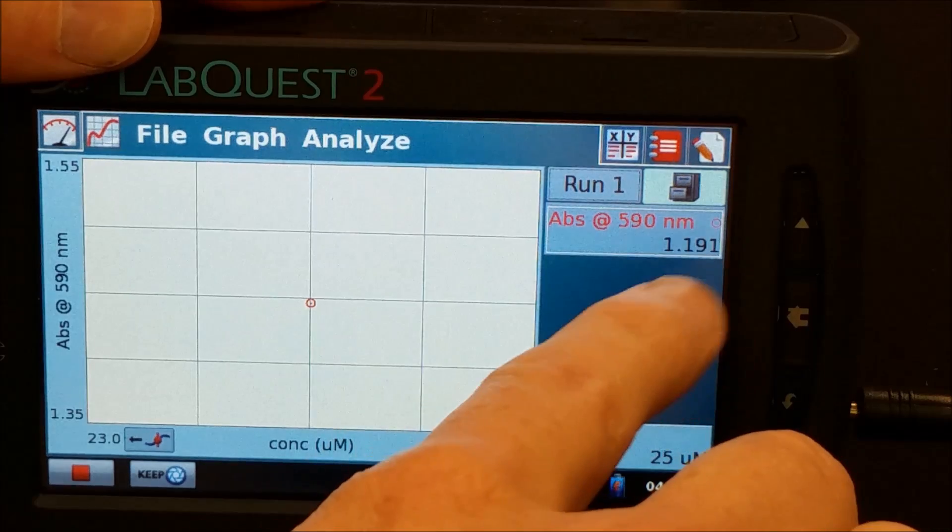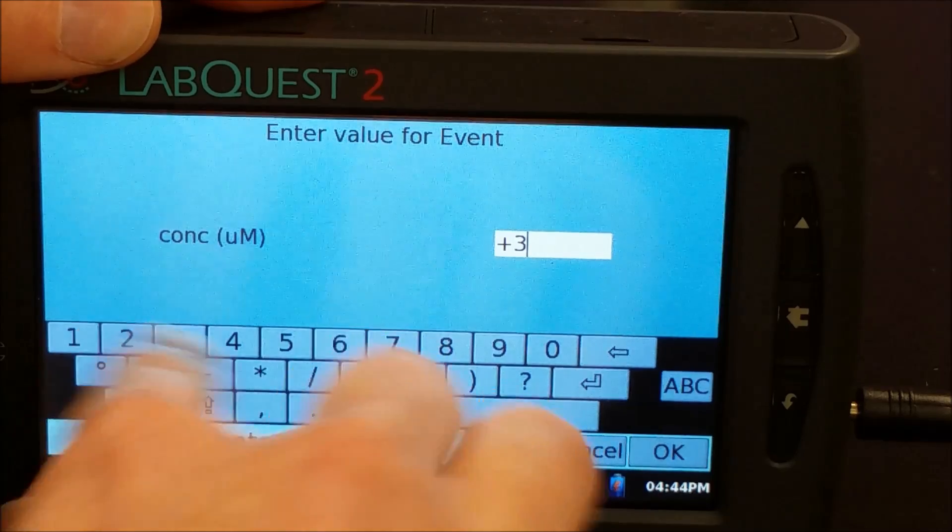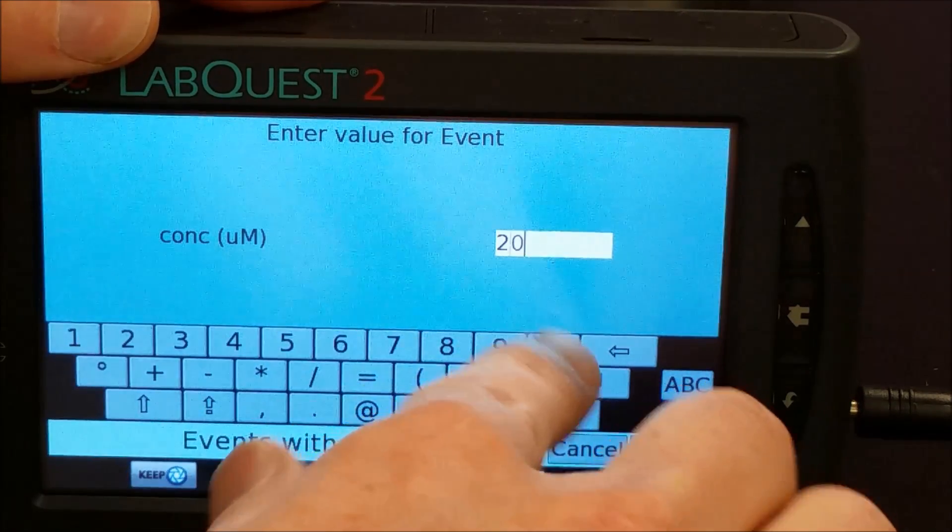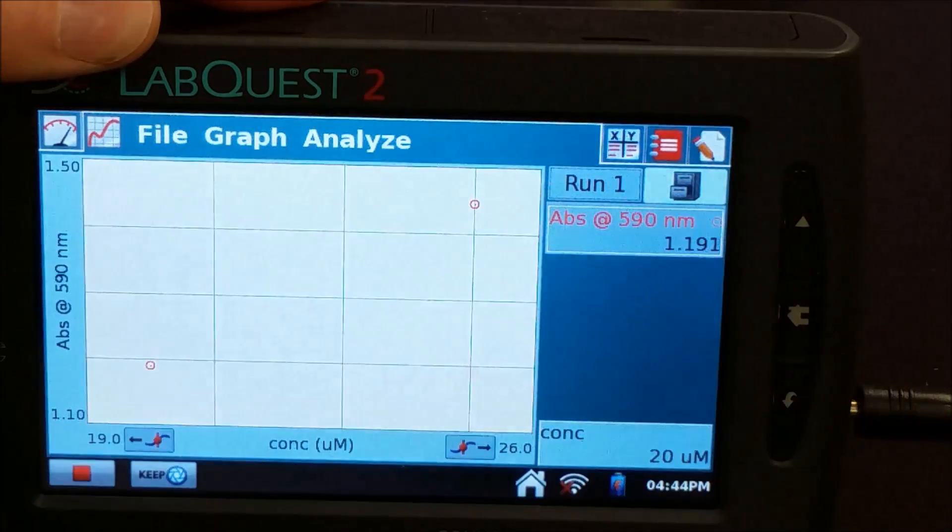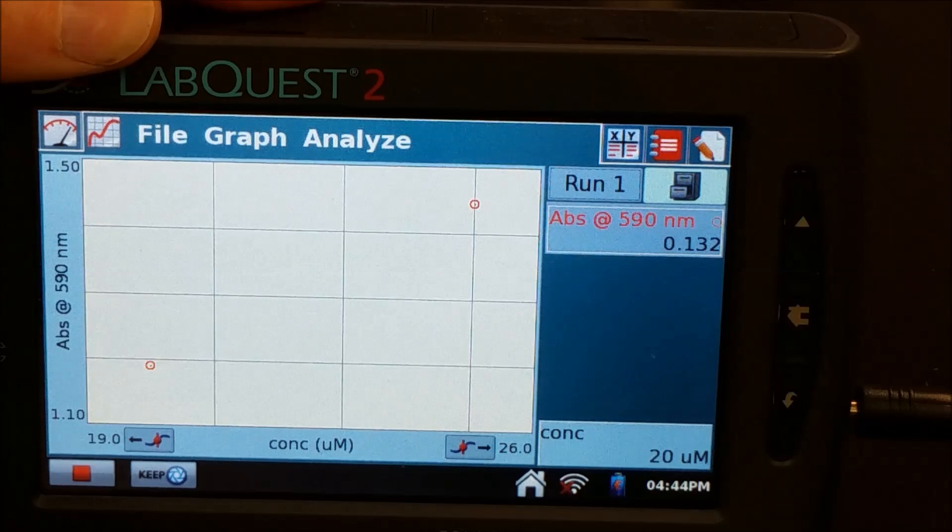And again, I want to wait for it to steady up here. When it does, I'm going to hit keep and type in 20. And I'm going to continue doing that until I have all of my data.